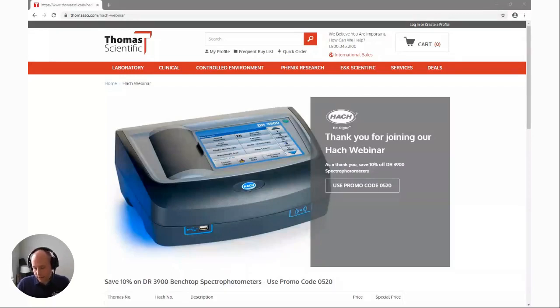Hach actually offers a recycling program for the COD vials. Those do still contain mercury, chrome, silver, and sulfuric acid. They're actually pretty nasty, but that's the test. It's a method-defined parameter, so there's no getting around those specific reaction conditions. We've minimized the volume, but we offer a recycling program where we can send you a bucket, you fill it up and send it back, and we recycle those.